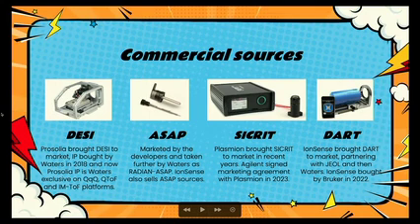Intellectual property for that was subsequently bought by Waters, and the Prosolia IP is now available as the Waters DESI source, which is available for Waters QTOF instruments, and as of ASMS last year, it's also available on their triple quadrupole TQ Absolute instrument. And I can say from experience that makes a particularly nice combination.